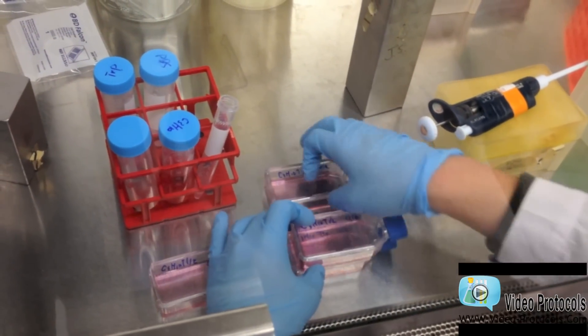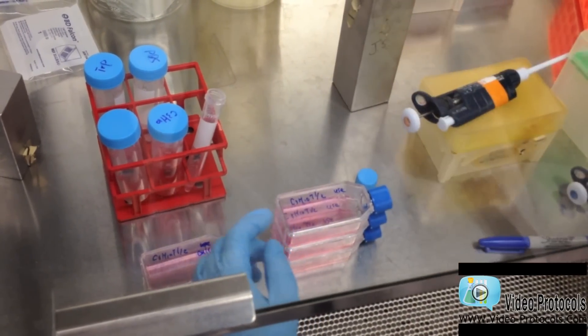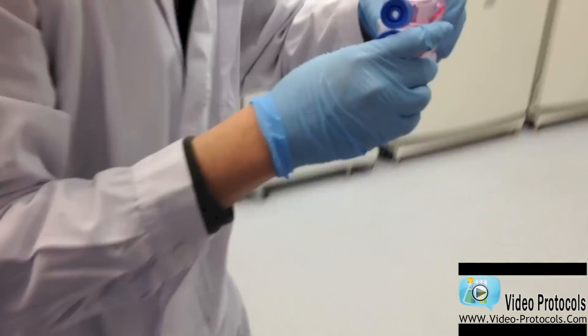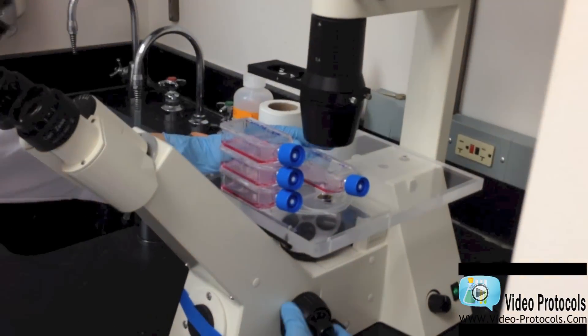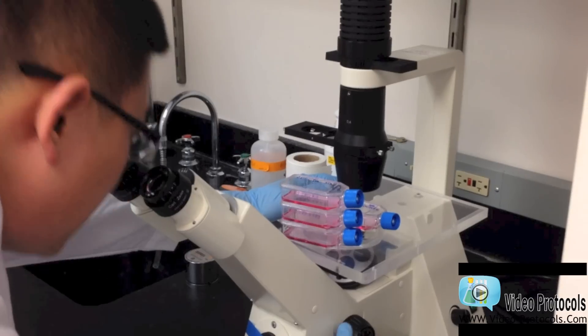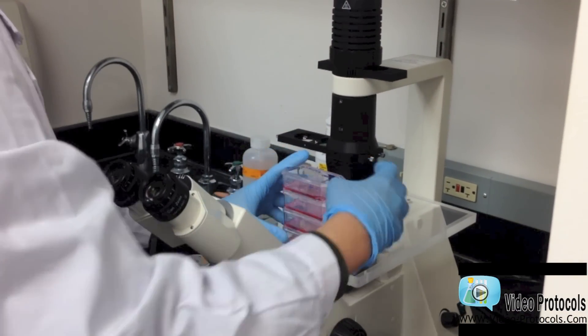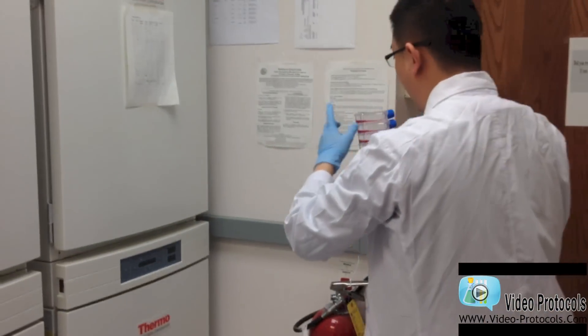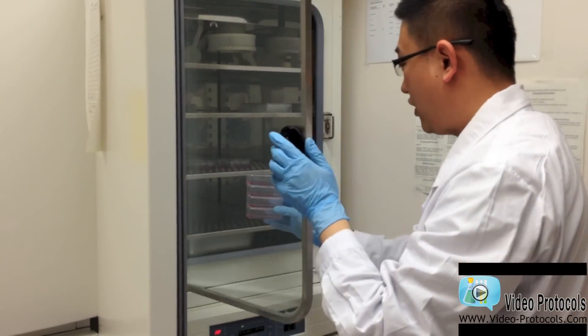After this step is done, the leftover cell suspension should be aspirated. And I will take a look at those flasks under the microscope to see if I get the right cell density. Now that I make sure all the flasks got the right cell density I want, I then put them back in the incubator.